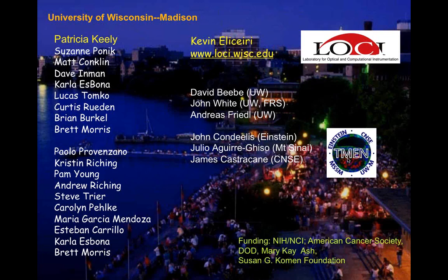The last question I see here is, were any of these studies longitudinal studies where you were repeatedly imaging the same animal over different days, or were they all single-shot experiments? Yeah, you can do that, and that's one of the powers of the mammary imaging window. But none of the data I showed you today was actually looking at the same animal over time. We were doing one shots at each data point. But that is something you can do.